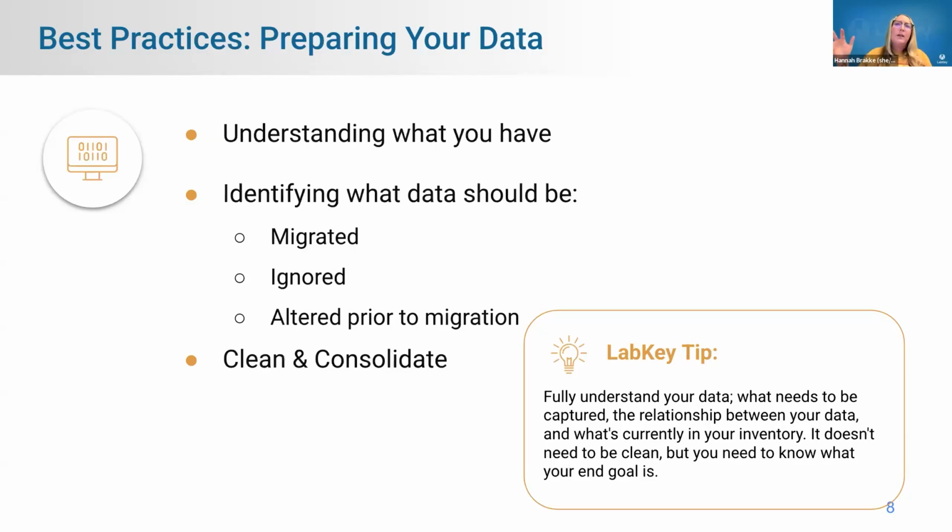So the LabKey tip here really talks about this whole set of things. But really, knowing the relationships between your data can also be very important in terms of the migration, because the more we understand about that data, the easier it is to build those relationships upfront, or even identify things that we might need to build those relationships for during the implementation of your LIMS as well.